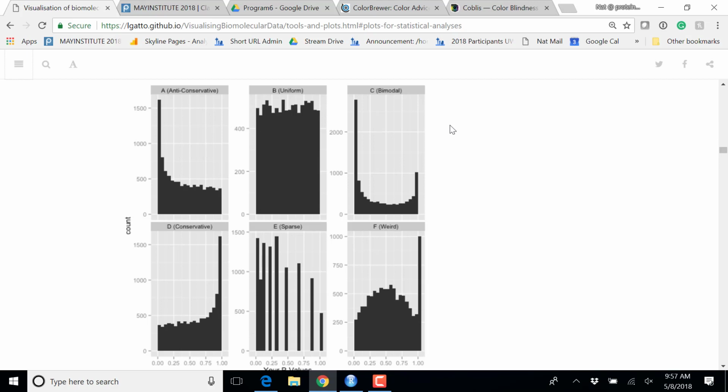If we obtain a uniform distribution here, this indicates that, at least with the conditions that we had, the number of samples that we had, and so on, there is nothing that will survive adjustment for multiple comparison. Even though if we look at the raw p-values, some are small. After adjusting for multiple comparison, nothing will be there.